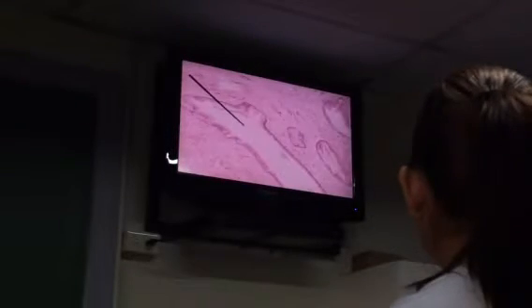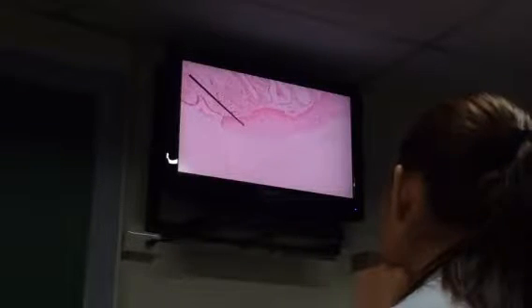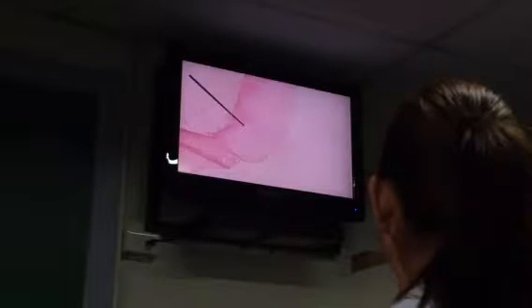On the other hand, if you study your exocervix, there you go, you see the stratified squamous non-keratinized. And if you look at the lamina propria, as you go further distally, you will see already the decrease or almost none, no more glands in this area. Okay, and that is the difference. So this is again lining epithelium and this is lamina propria.